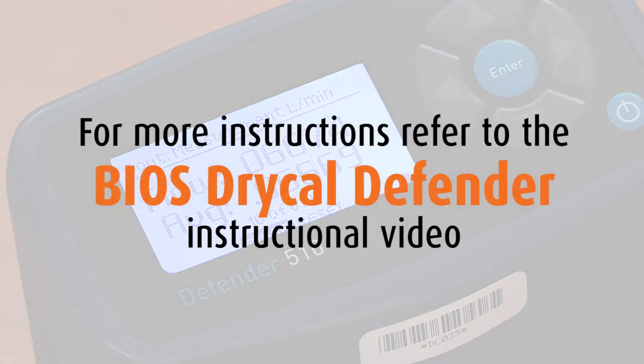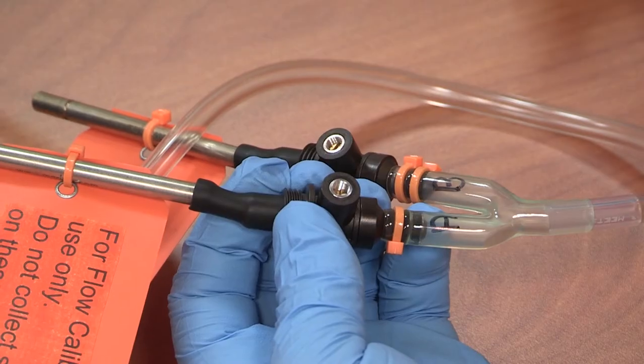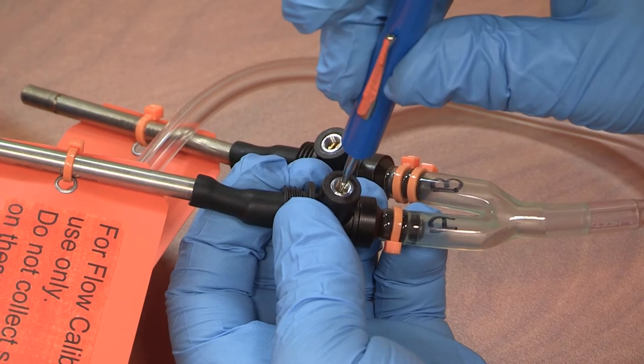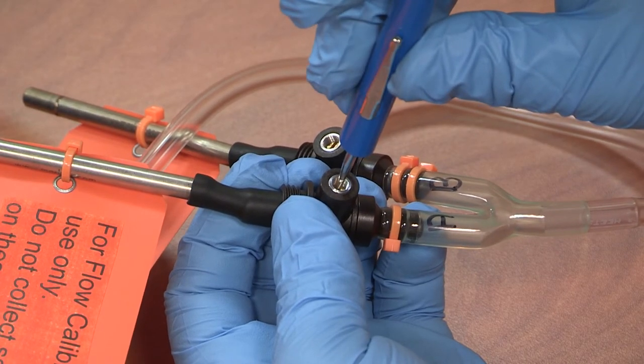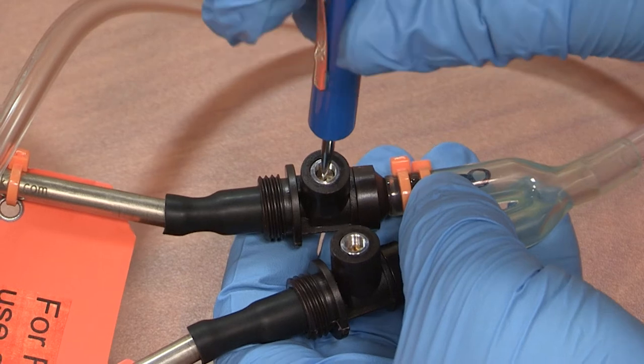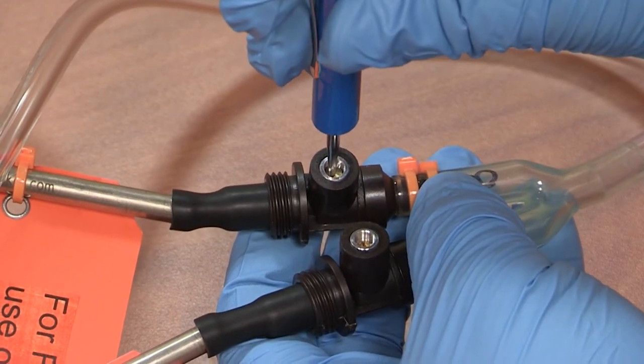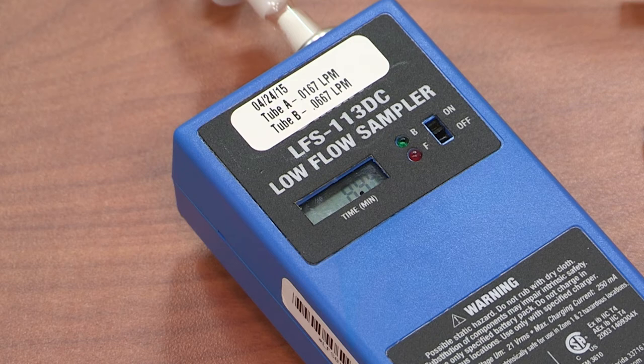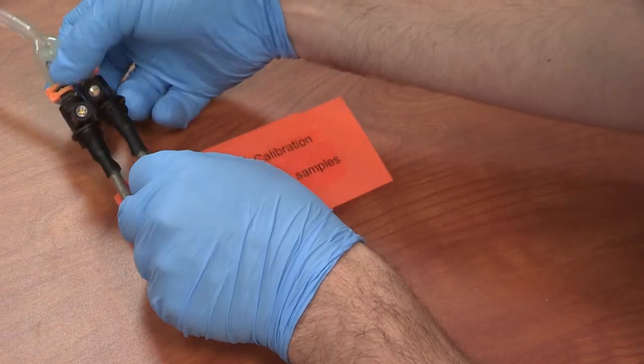After the tenth reading, the calibrator will average all ten flows and provide a calibration reading on the bottom of the screen. For more instructions on the calibrator, refer to our BIOS dry cal defender instructional video. If adjustments to the flow need to be made, do so with the adjustable flow controller at the end of the tubing. Adjust one side of the tubing at a time; when they are both set, confirm that the first side is unchanged. Never adjust the flow of the pump or detach the tubing from the pump.